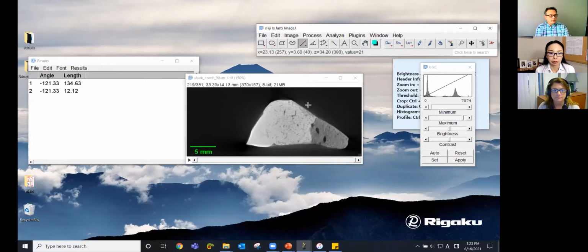Okay, we have another question that I think we'll be addressing later, which says, can you determine the amount of aeration in the tooth? Yes, we will use a different scan, but you can quantify how much pore or air volume is in the tooth. We'll be showing that later on. So to answer Robert's question, you'll see that shortly. Okay. Thank you.